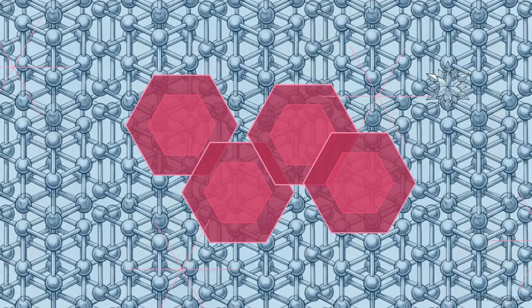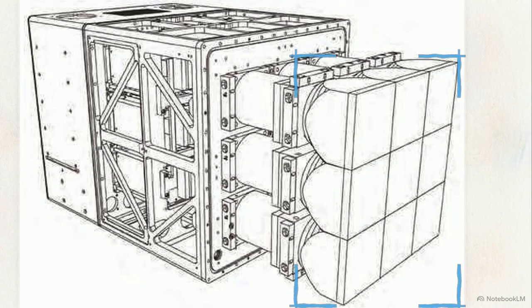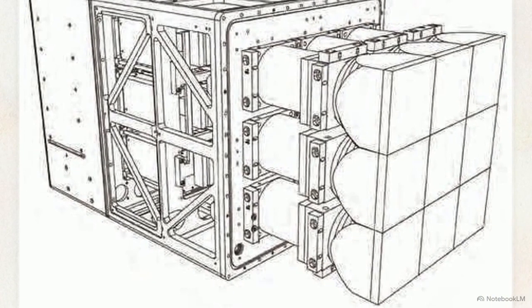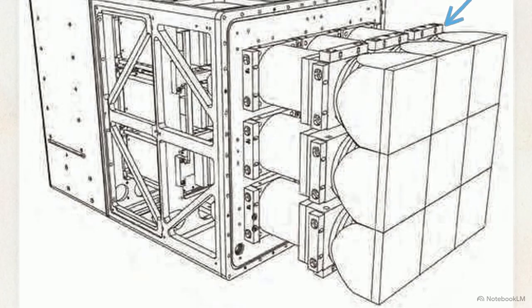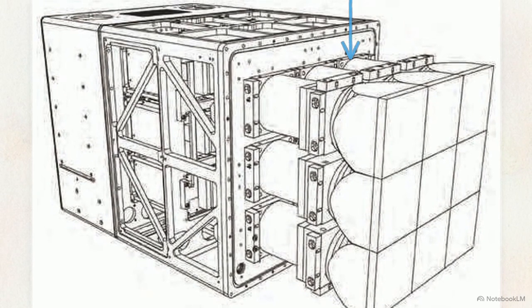The final step of the pipeline is capturing hundreds of thousands of distinct reflections over a wide solid angle. This schematic of a 3x3 detector array details the conversion process. X-ray photons strike a fluorescent phosphor screen on the front, converting them into visible light. That light funnels down through these bulbous optical glass fiber tapers directly into the semiconductor array processing the signals.